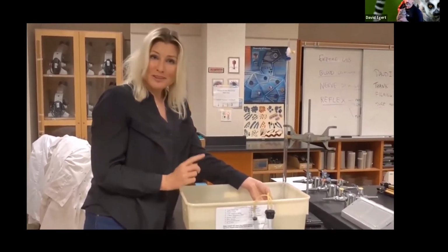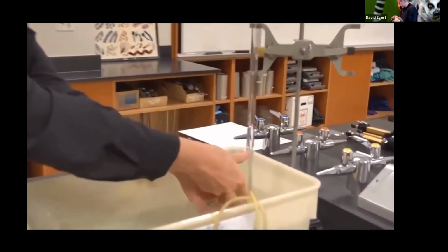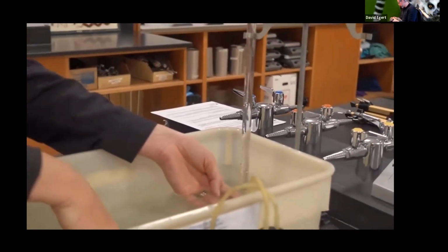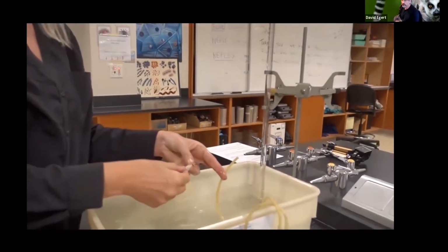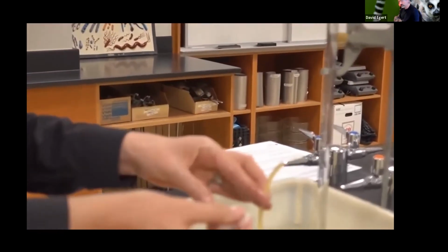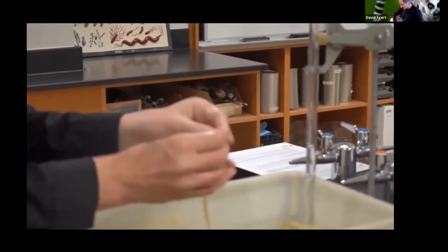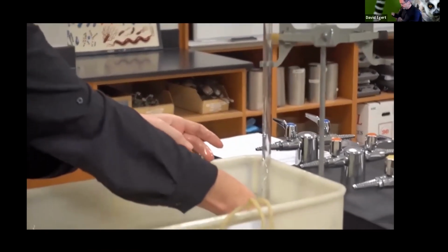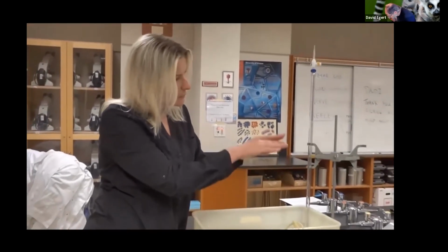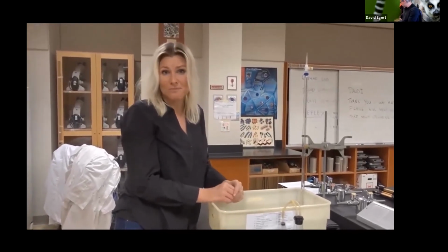And then new for this time, we haven't done this before, but we have experienced sometimes that we get enormous bubbles traveling up, doing a major displacement. So this time we're going to actually try putting some of this gauze or cheesecloth that has large holes in it. We're going to try to break up those big bubbles by putting this on like this and inserting that into a burette, and hopefully get a little bit finer bubbles, so it makes it easier to read the various readings.